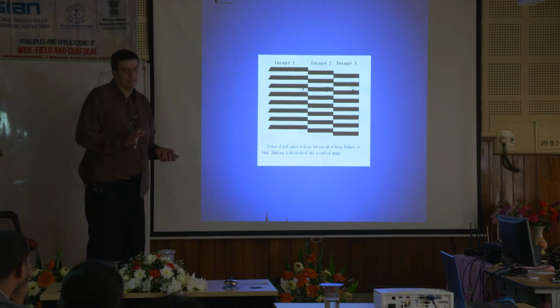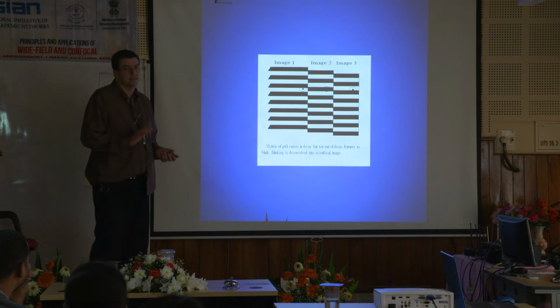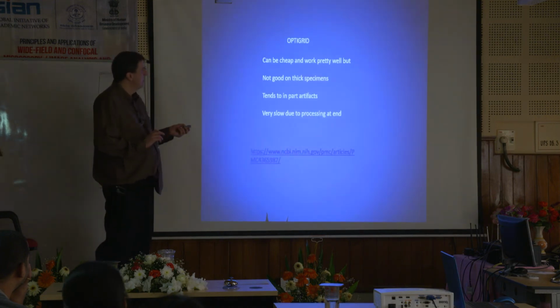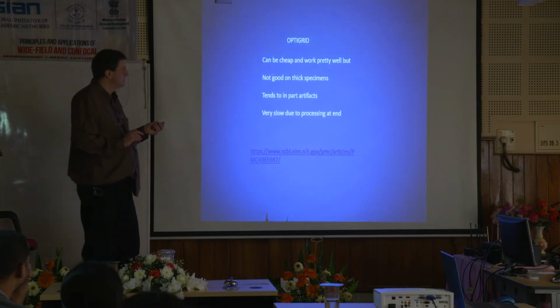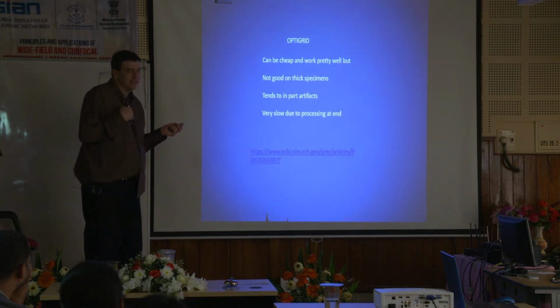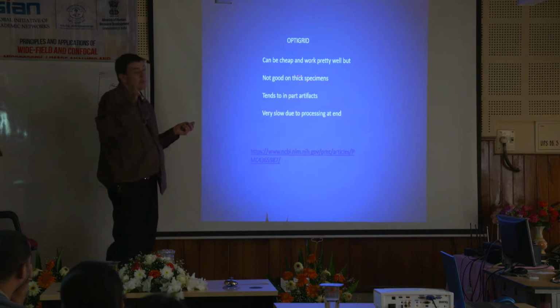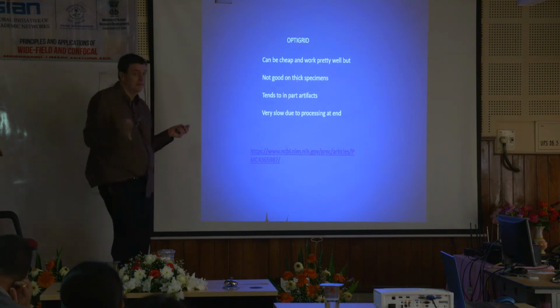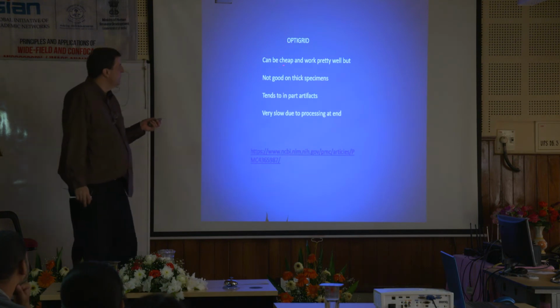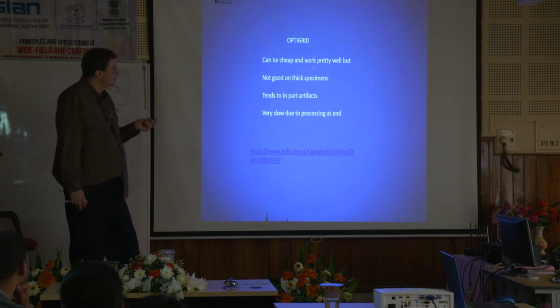And like I said, some labs, a couple I have worked with, they just love the thing. But Optigrid can be fairly cheap. Sometimes Zeiss, like when I used to go against them in sales, we'd be going back and forth. I think they're going to buy the Nikon. Then Zeiss would go, well, we'll throw in an Optigrid on the system. And then I'd lose. So sometimes it hurt me. But it can be fairly cheap.